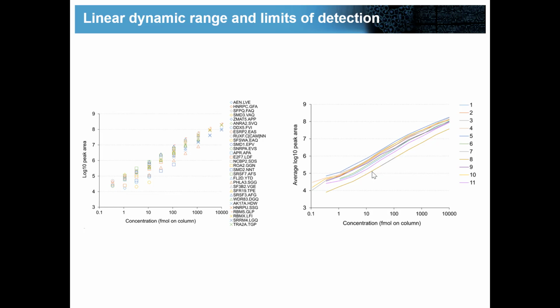That's not the case, actually. So my experience is mostly with QTOF instrumentation. If you now go to trapping instrumentation like quadrupolar Orbitrap, there I think you potentially, in those kinds of more simplified sample matrices, you might see some benefit in terms of dynamic range because of the ability of the instrument to basically accumulate more ions.